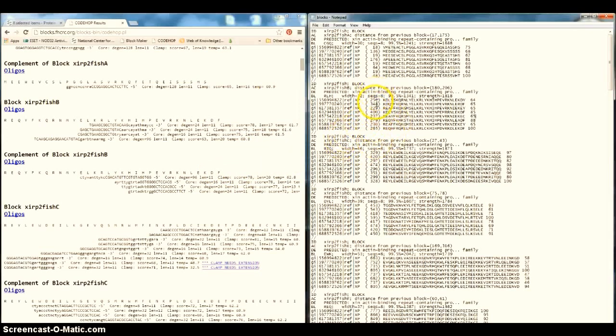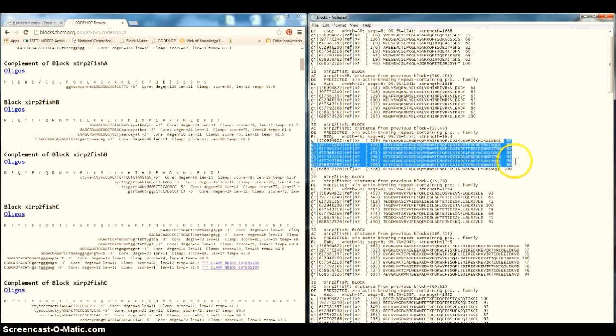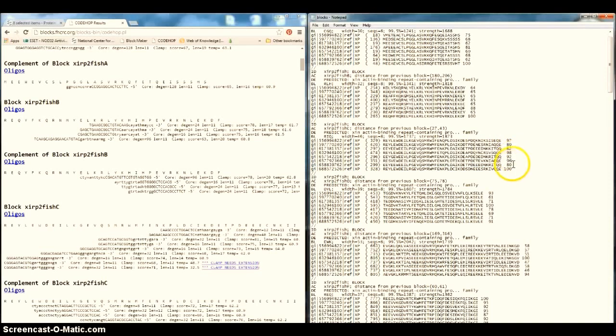Let's choose block B because it's near the beginning and doesn't include gaps, so it will be a good option to check primers from here. You will see it's kind of similar, and we don't know exactly, but here the numbers are quite small. So let's pass to C, and here the similarity is more than 80, and that's good.